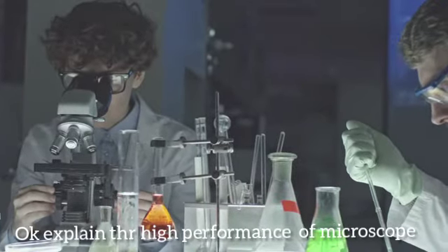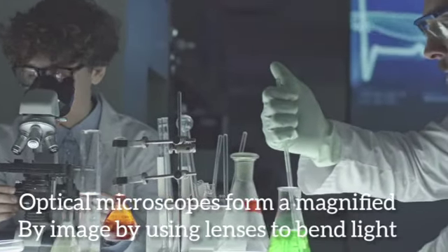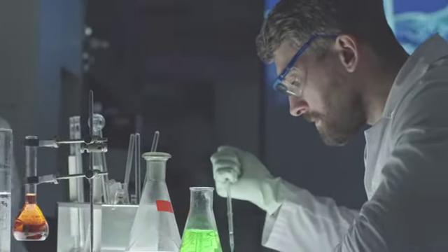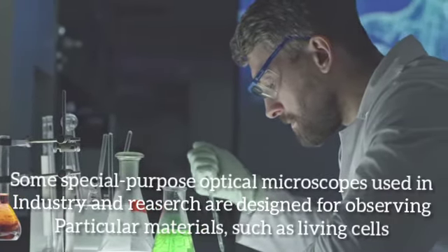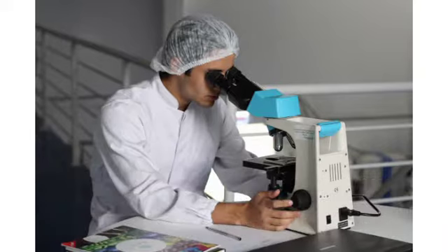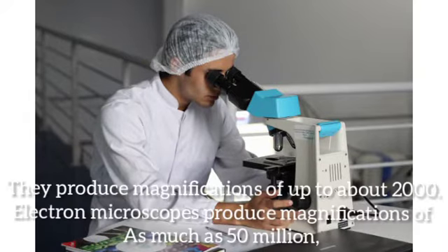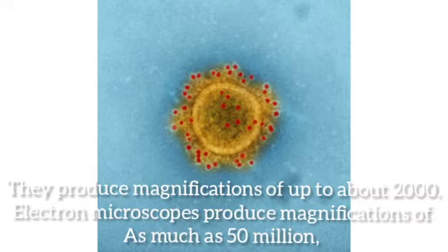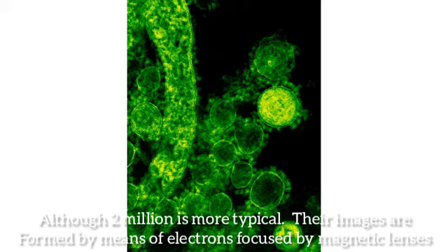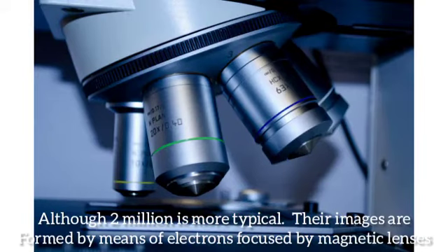Okay, explain the high performance of a microscope. Optical microscopes form a magnified image by using lenses to bend light. Some special purpose optical microscopes used in industry and research are designed for observing particular material, such as living cells. They produce magnifications of up to about 2000. Electron microscopes produce magnifications of as much as 50 million, although 2 million is more typical. Their images are formed by means of electrons focused by magnetic lenses.